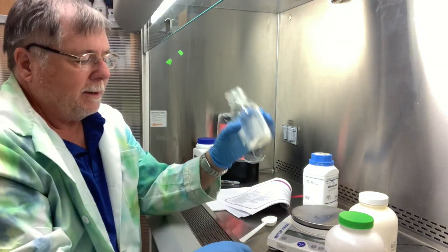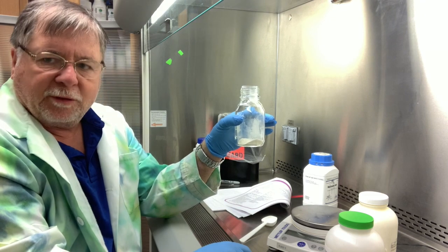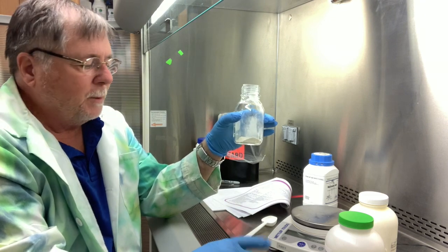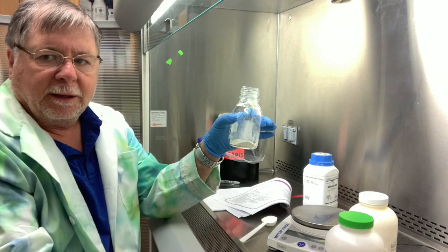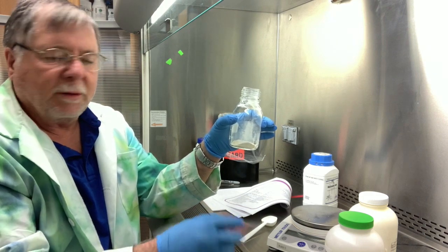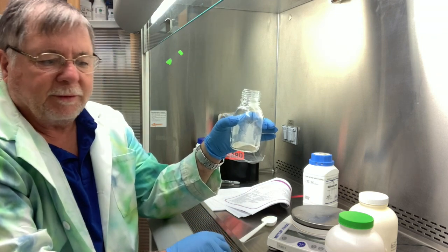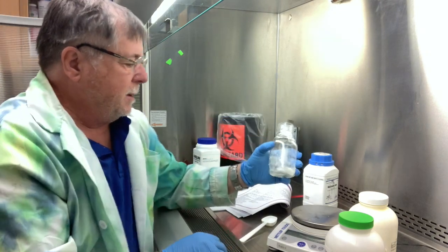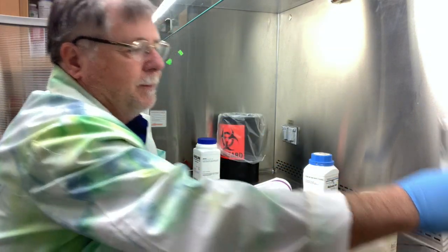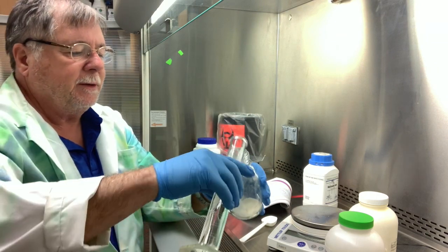All right, so now in this bottle, I have agar and tryptic soy broth. And so then we call this TS agar. It's tryptic soy agar, but generally, we're going to just call this TS agar. And we'll go add the water now. So we should have about 100 milliliters in here.